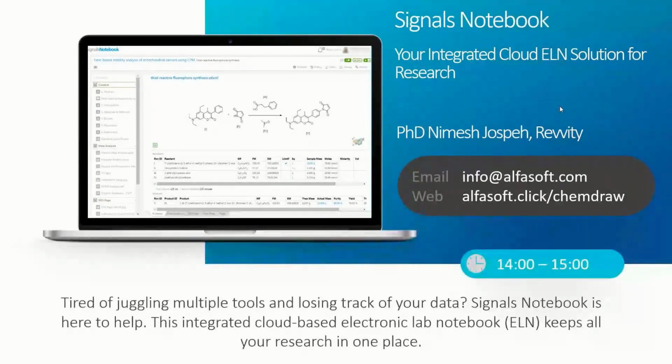I think some of the listeners today might have heard of Spotfire, or might have used it, are using it now, or used it in the past to analyze and visualize assay data, such as plate-based dose response curves or SPR assays, qPCR, to name a few. We can connect instruments, systems and services to communicate bidirectionally with Signals Notebook via Signals DLX, powered by our partner Cytara.